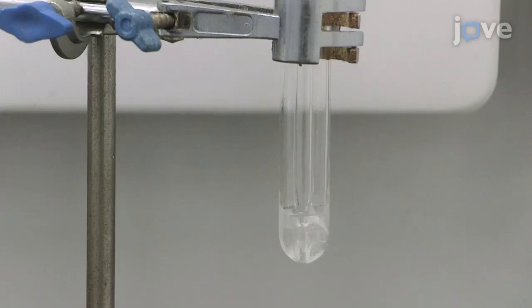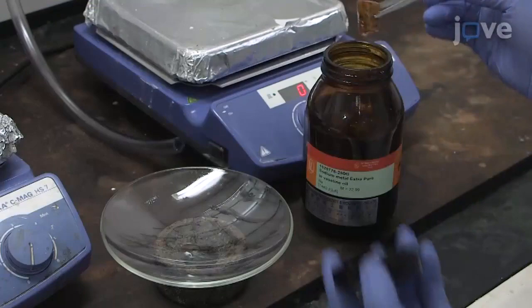From then on, keep the flask filled with flowing nitrogen gas at a slight positive pressure. Next, remove a block of metallic sodium from the mineral oil in which it was stored.